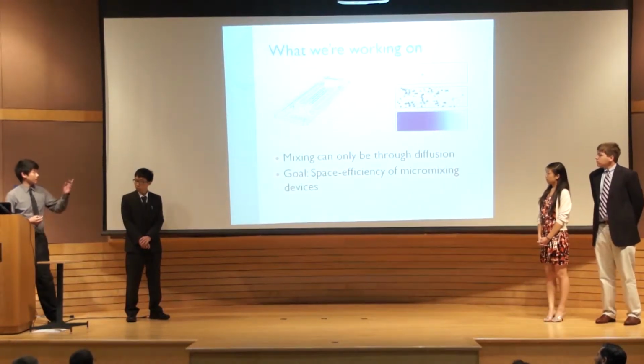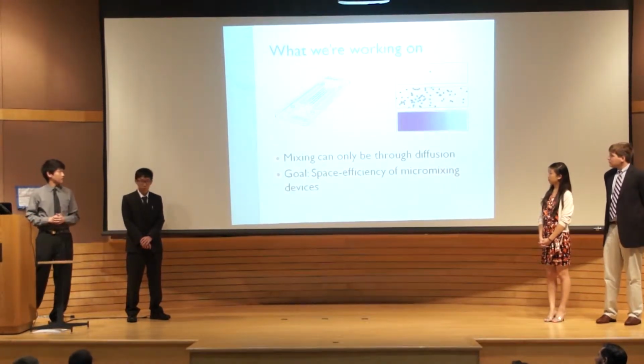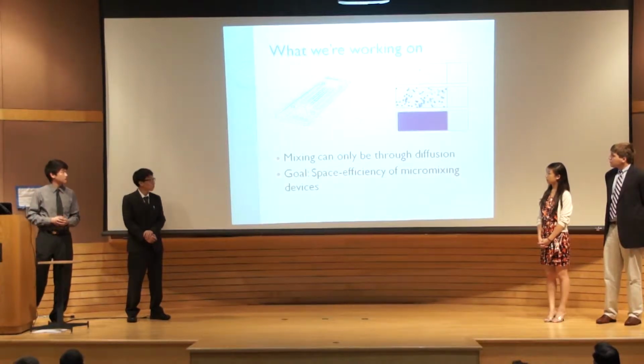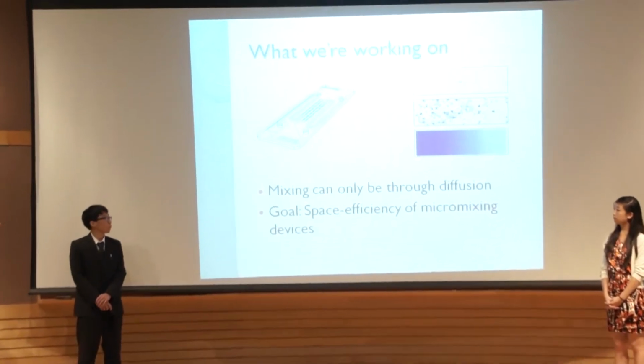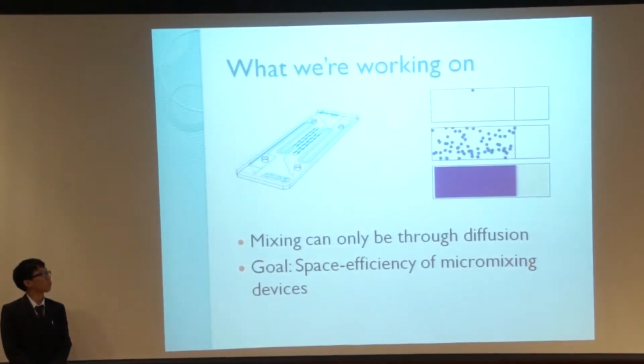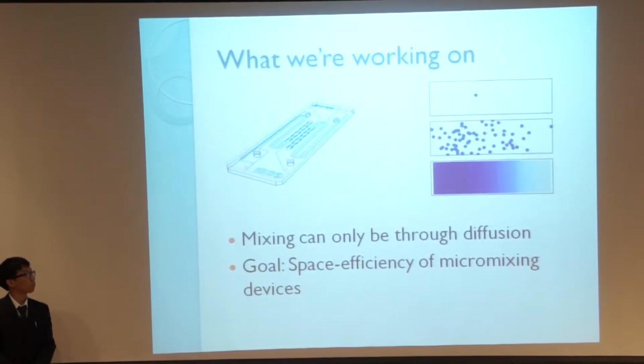So what are we doing? The model on the top left shows the standard microfluidic device. The cylinders on the top and bottom show the inlets and outlets. Our designs are actually a bit simpler than this. We'll show you these later on in the presentation.